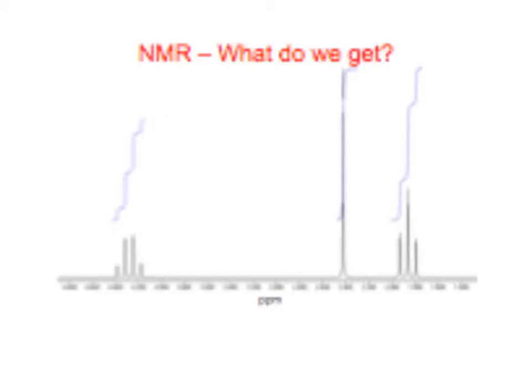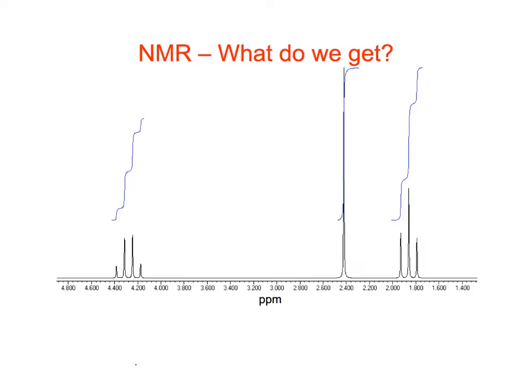All right. Okay, so enough of kind of general theory for us. What we'd like to do now is start to think about what kind of information we can gather from NMR. So if we look at this simple spectrum, what can we get out of this? What parts of this give us information? Super clean. Yeah. It's not very interesting though either, right? What is it? Give it 3 to 1 maybe.